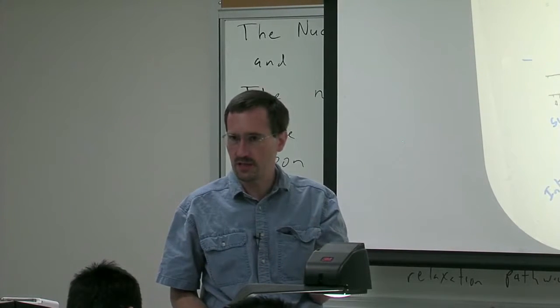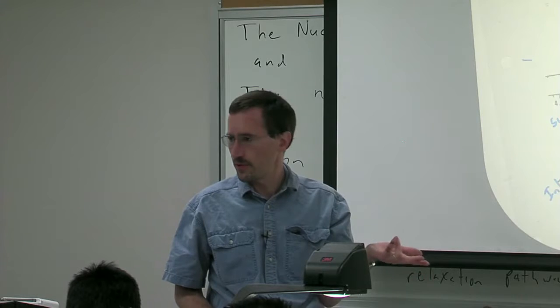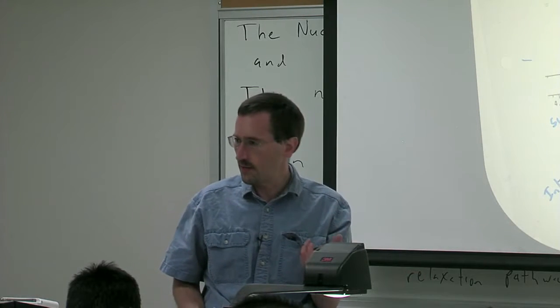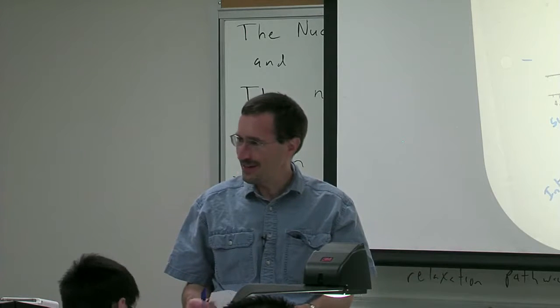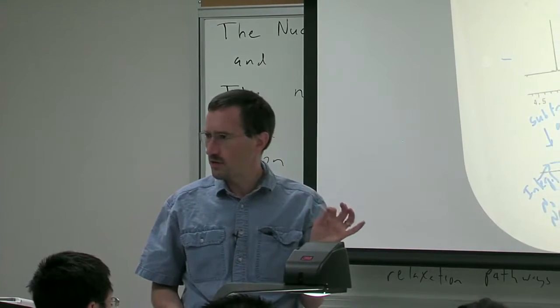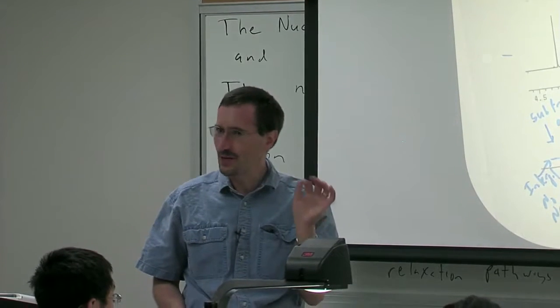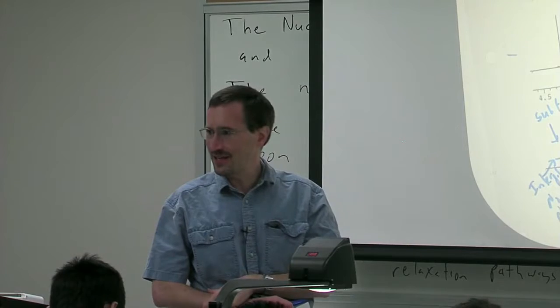Imagine if this were your thesis molecule. It would be no big deal to spend 3 or 4 hours on the NMR spectrometer for an important problem. But we're 22 people here. You've got other things to do. So I've cut it down to 1 or 2 nice 1D experiments where I basically had pre-selected the key experiment.